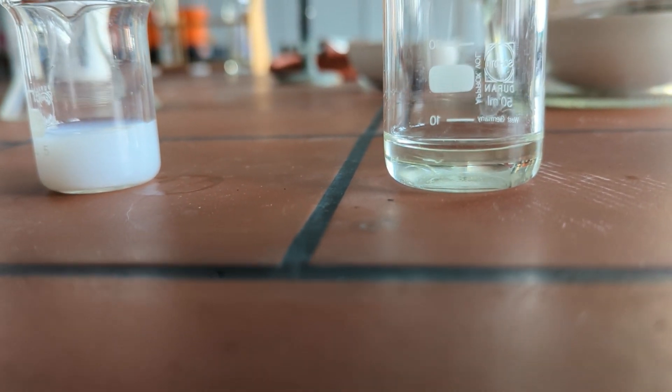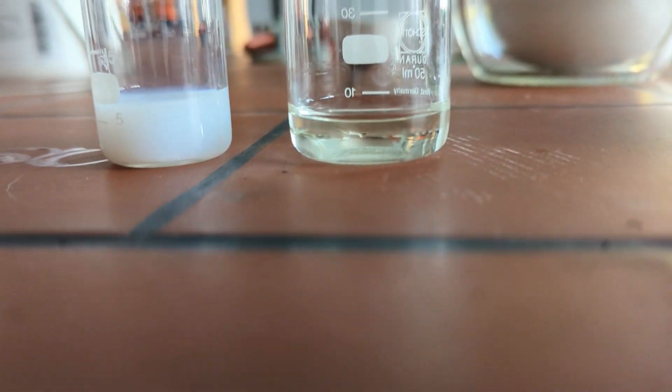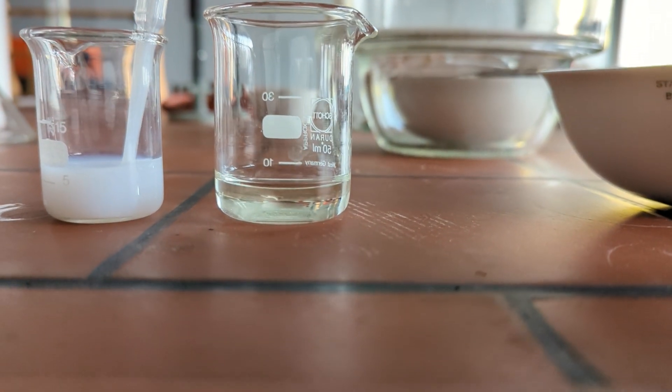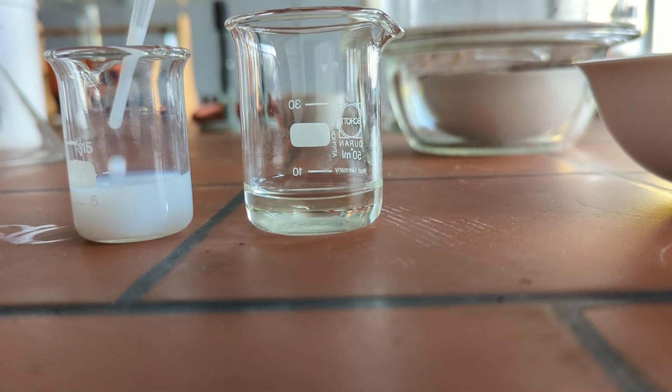Another option is using a silver halide — here, silver chloride. We add some drops of a suspension of silver chloride into our cyanide solution.